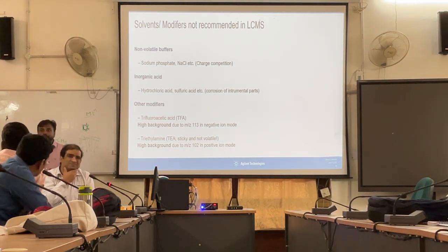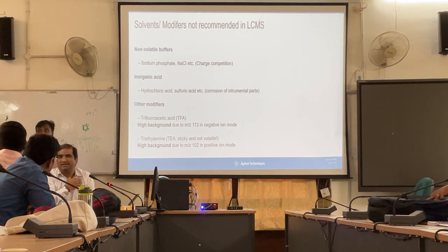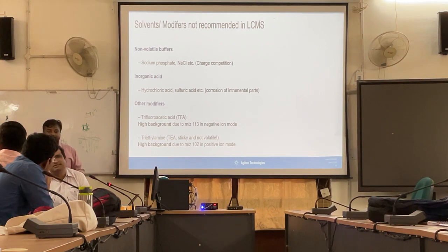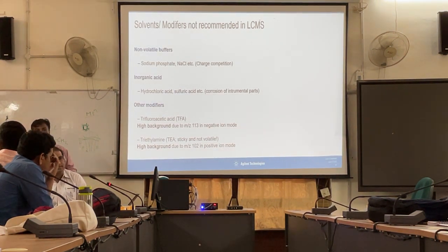I understand. So you understand, like if there is a TIC which is having the tailing, but in the very next moment if you extract the same masses, then the peak shape would be better. Why is it? Because the data points required on the mass basis are very good. So the chromatographic challenges would not be with the mass spec side.